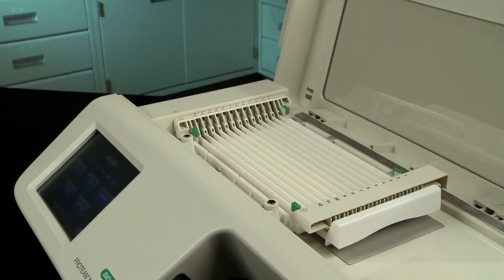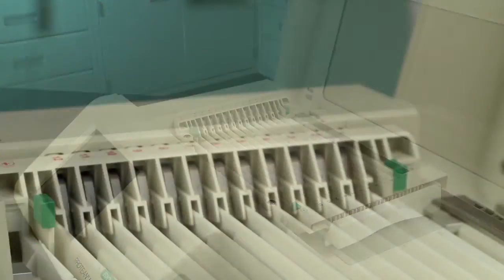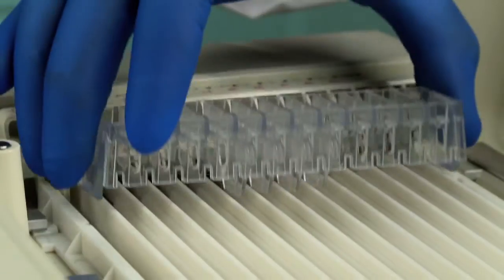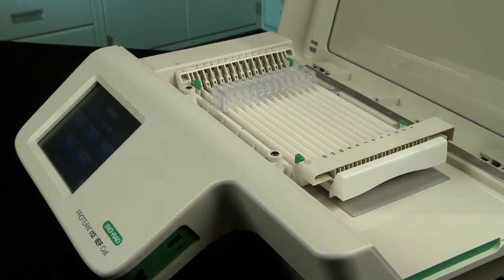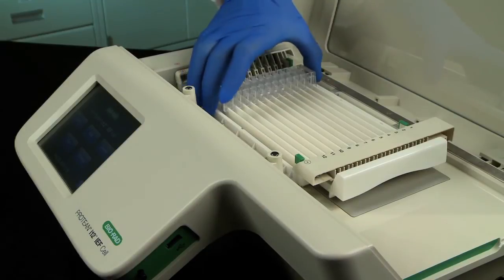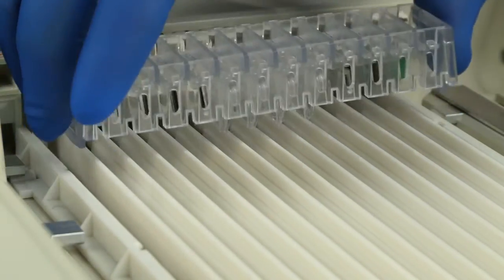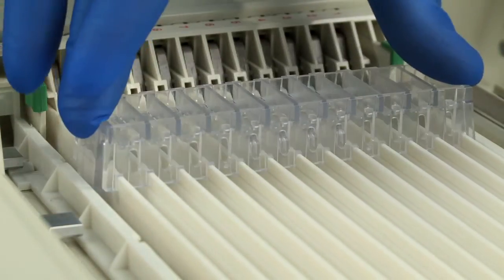Choose the desired location for the sample cup assembly. Snap the assembly onto the tray until a click is heard. Once the assembly is in place, do not slide it along the tray as it will damage the IPG strip. If you would like to reposition it, unclip the assembly, pick it up, and reposition it on the strip.